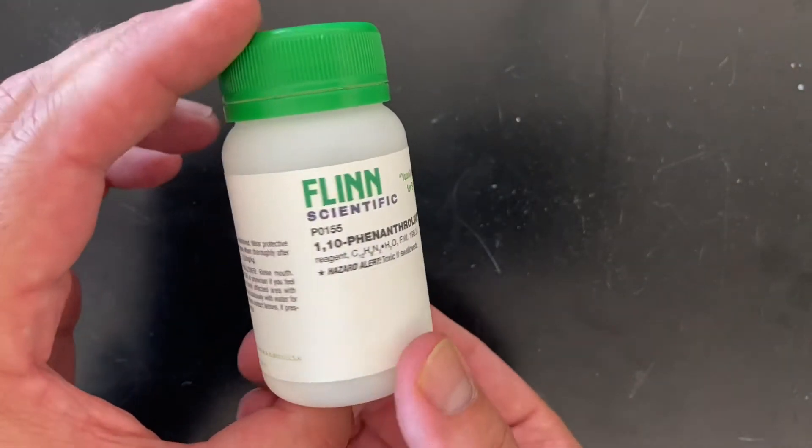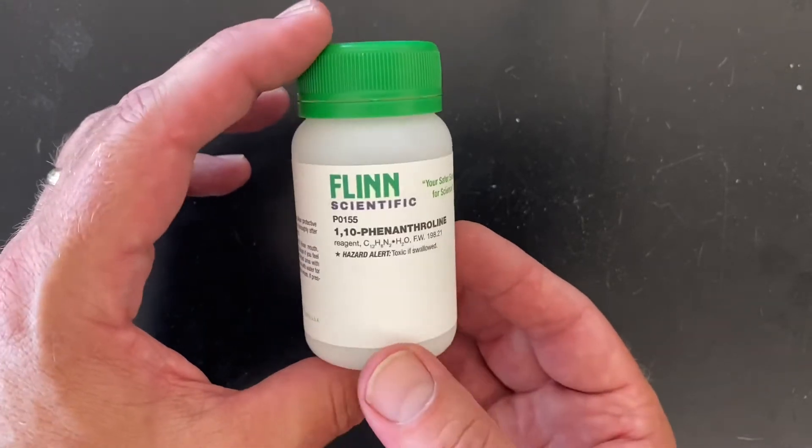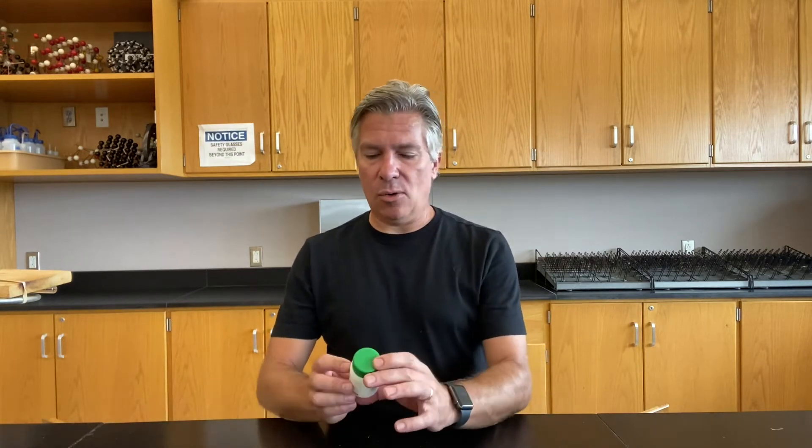Sometimes chemicals come in very small quantities, maybe because they're pretty rare or you just don't need a lot. This is actually only a five gram sample of something called 1,10-phenanthroline, which is really fun to say. If you've been paying attention in chemistry, one of the biggest benefits is to speak chemistry and say fun names like iron(III) oxide, manganese(IV) sulfide, or 1,10-phenanthroline — you can drop names like that at a party or to impress someone.